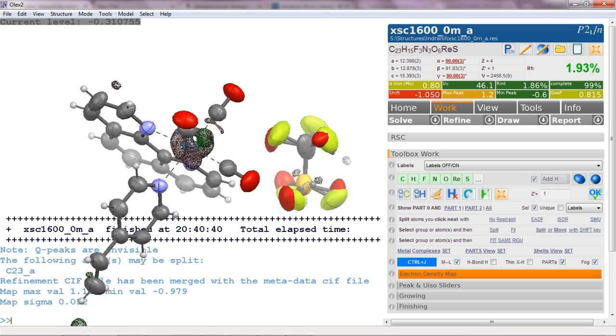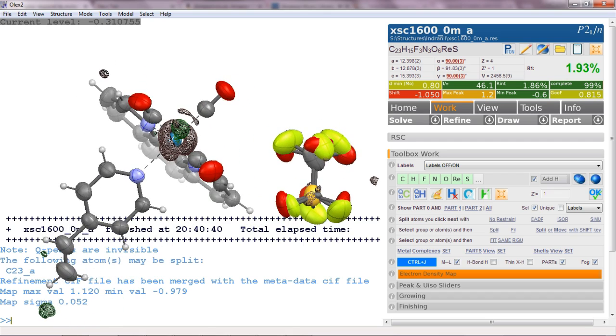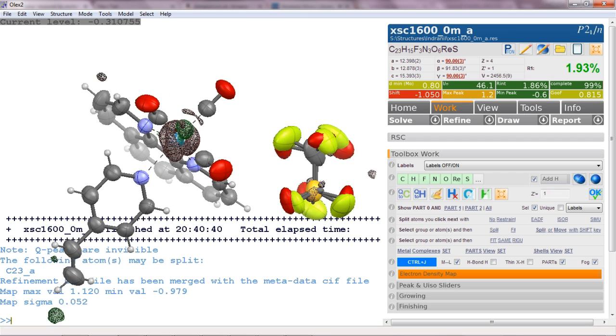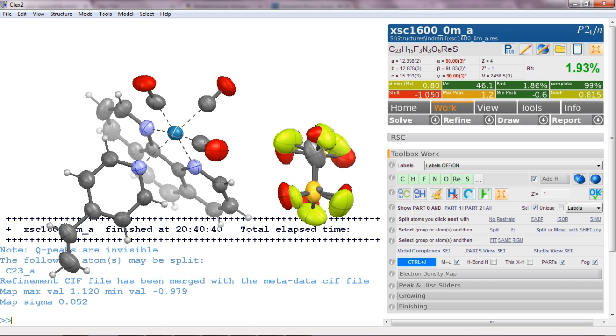And this is 1.93 percent and let's have a quick look at the map and see what happens there. So there's nothing happening here anymore. So I think this is fully done. And this looks very, very clean. The level is 0.31 minus 0.31. So there's no worries here. Just to make the ADP sensible here. This is clearly they're very much in the same space. So there will be correlations and it won't refine independently very nicely.